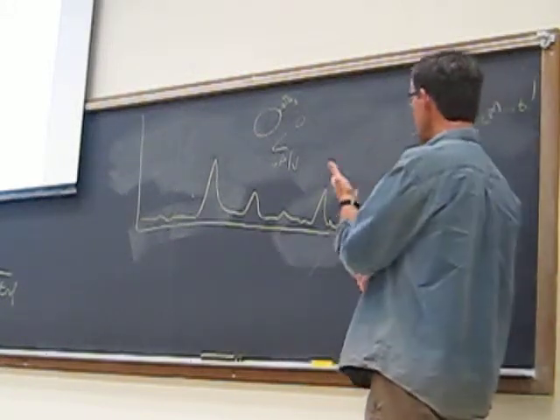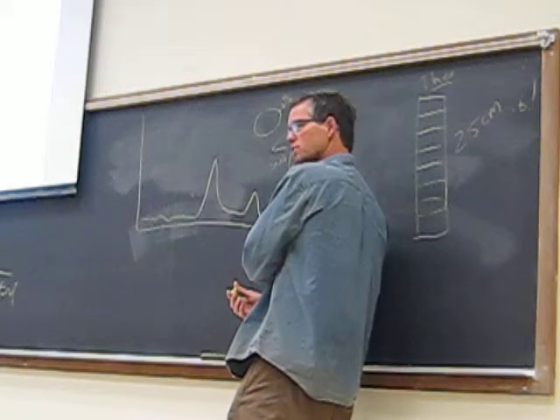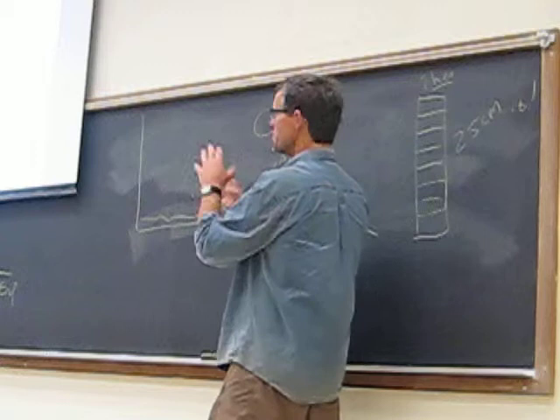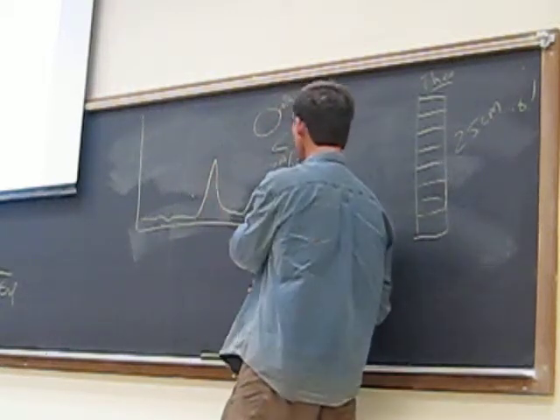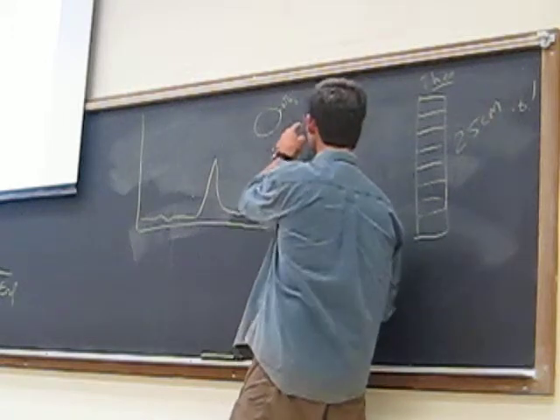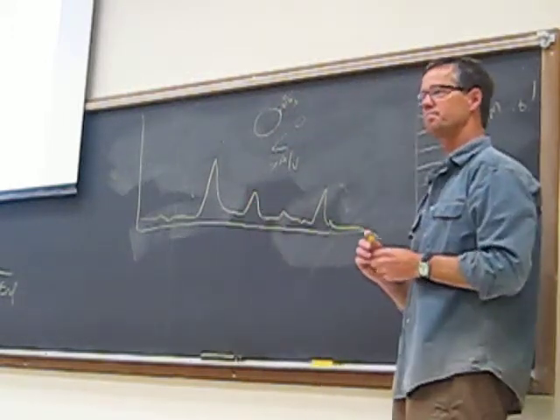I would run a chromatograph and get some kind of chromatogram from that elution. I would look at some of the parameters I have control over, and one of the decisions I might consider making is whether to try a different column, possibly one that has a smaller bead size, if I'm not adequately resolving some peaks.